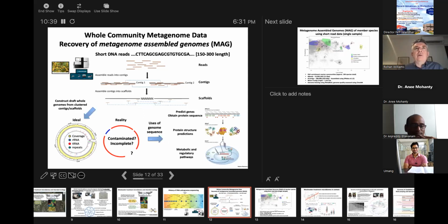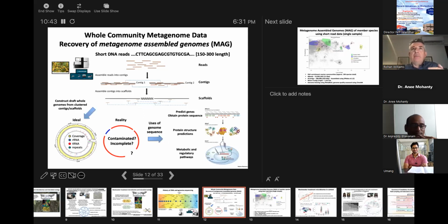So how is this work oriented? Well, we're interested in genome-resolved analysis. We extract all the DNA from one of these samples, we sequence it on one of these instruments, and in the case of Illumina, we end up with many, many short DNA reads. There are many ways this data can be analyzed, but I think the field is converging on the use of assembly-based methods as a kind of standard. Each of these short reads is combined by a computer algorithm back into slightly longer stretches of reconstructed DNA that are called contigs.